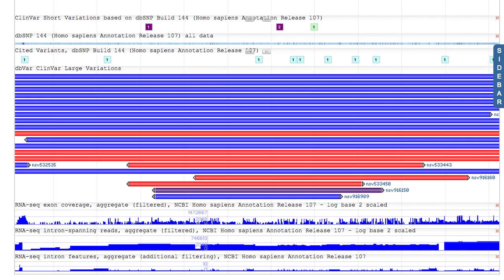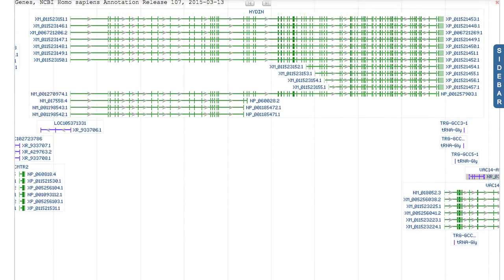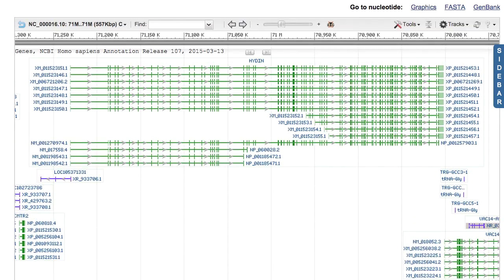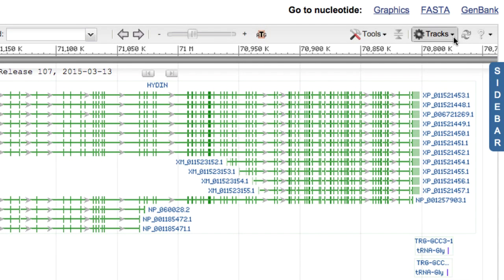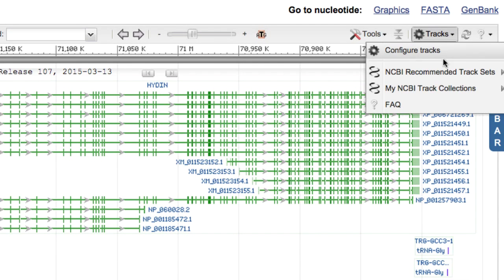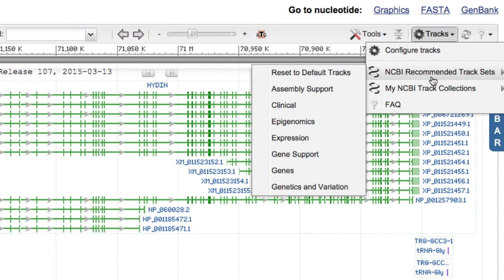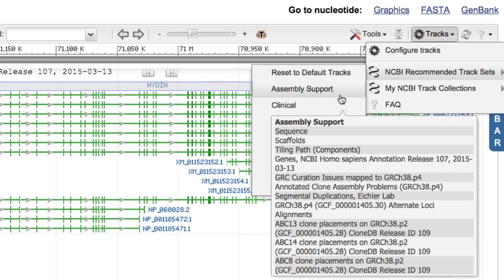The Tracks button found at the top right of the graphical view can be used to update the display. Hovering your mouse over NCBI Recommended Track Sets opens a submenu listing the available sets. The names of the sets indicate the type of analysis for which the included tracks may be most useful. Hovering the mouse over a track set provides a list of the included tracks.